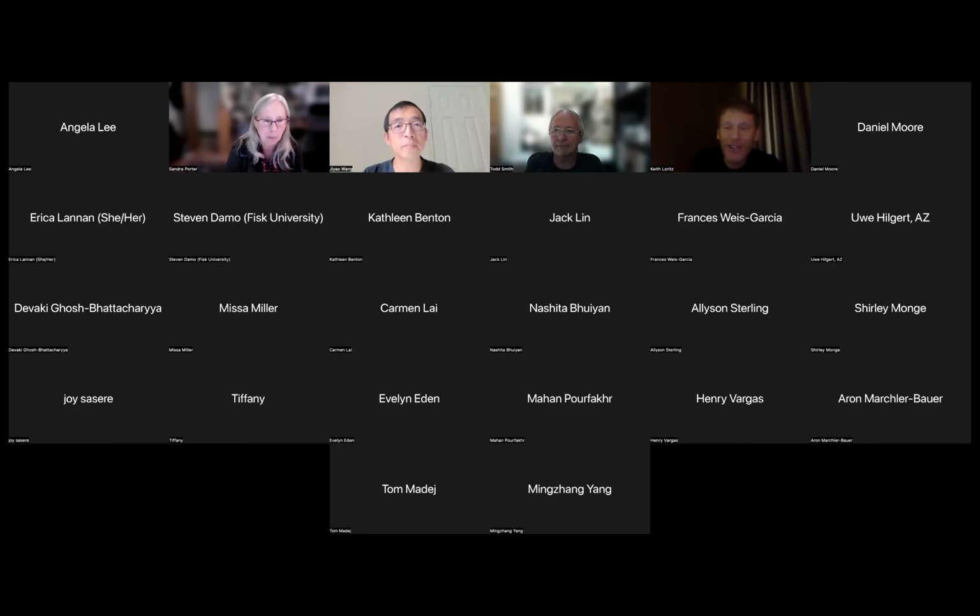Okay, so iCn3D looks extremely powerful. I would see this being a whole semester or a quarter for learning in a class. Give me a little history about it. Is this something that's used in industry, and how long has it been around? What's it programmed in? Is the programming accessible to users?